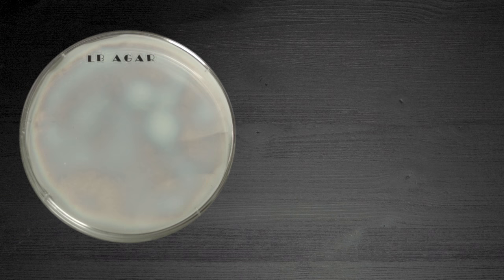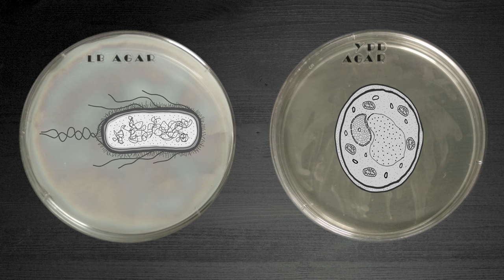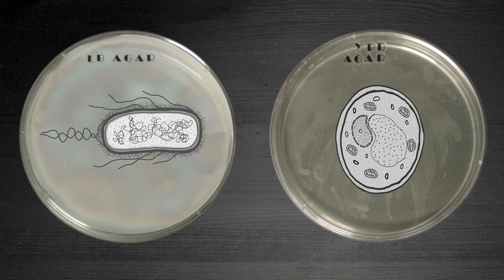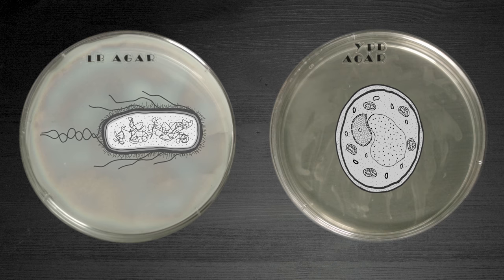We will use the LB agar and YPD agar plates to grow fresh E. coli and yeast, which increases the odds for a successful experiment. I don't advise doing both experiments at the same time, as it can get really confusing. But for brevity's sake, I'll demonstrate them together in this video.